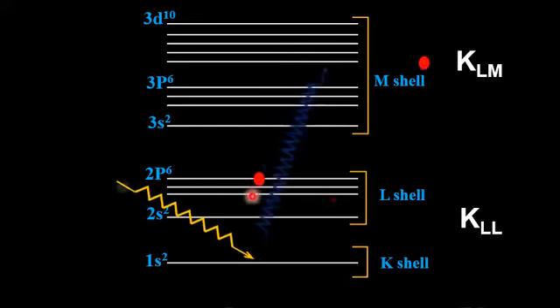When these characteristic X-rays interact with an electron at a higher energy level, if the binding energy of that electron is less than the energy of the characteristic X-rays, they will result in emission of that higher energy level electron, and that emitted electron is known as the Auger electron. The transition process through which the Auger electron is emitted is known as the Auger electron transition process.